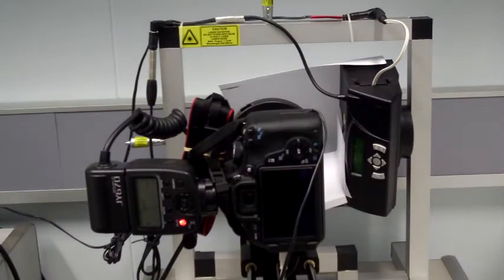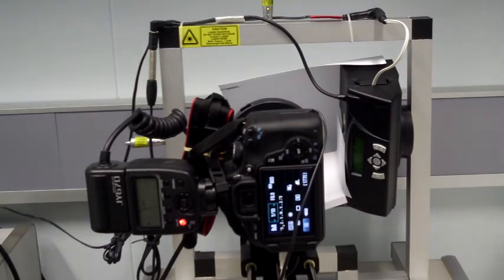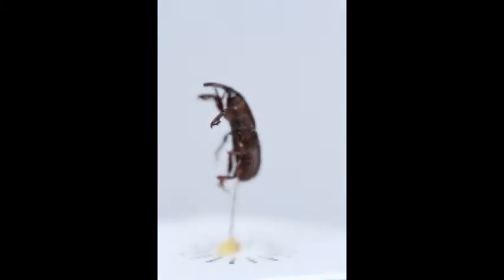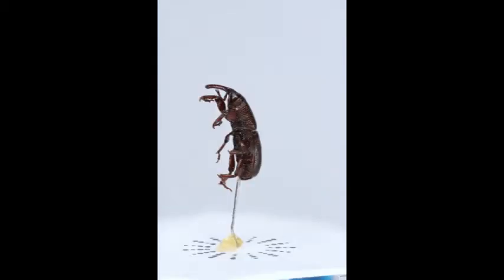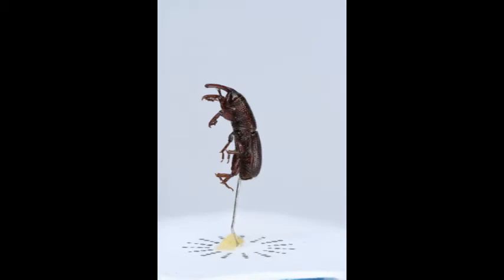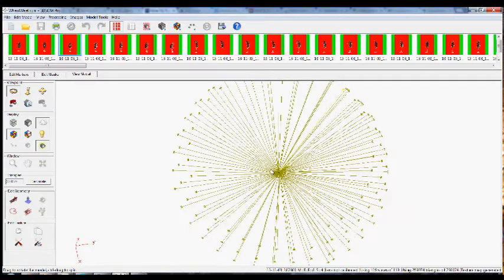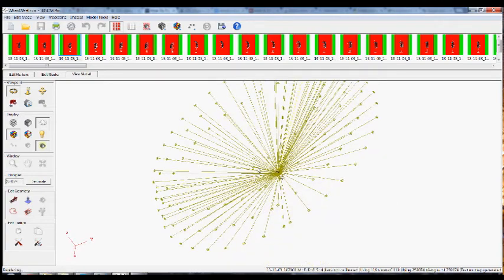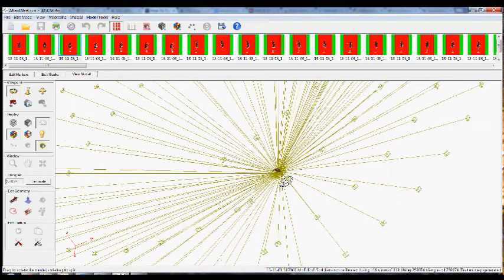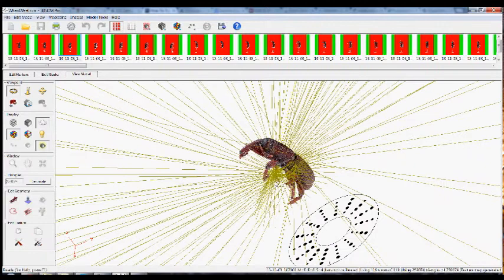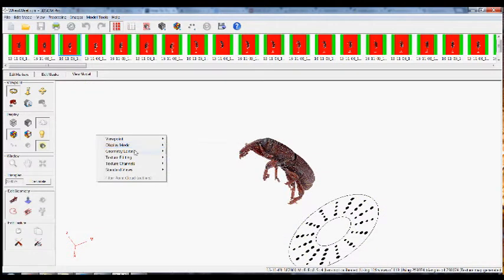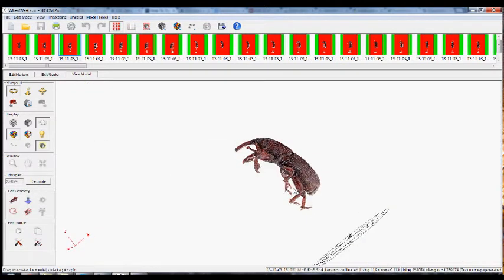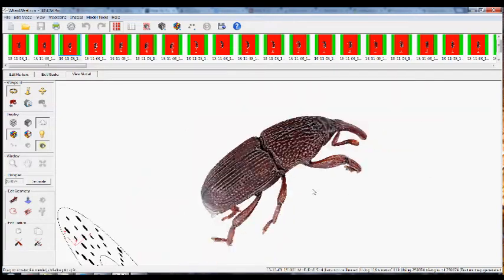It takes about 3 hours to finish capturing 4,500 images. Once we have the images, we combine the images captured from the same angle into a single in-focus image. Then we have a set of in-focus images captured at different angles, and these images become the input into a 3D reconstruction software to generate a 3D model.